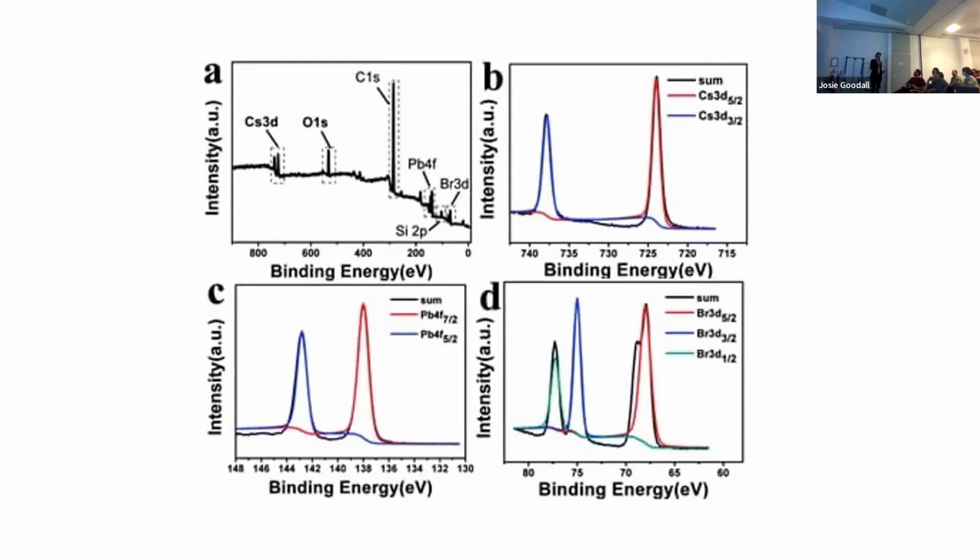Okay, there's a really obvious one. Backgrounds are wrong. Yeah, the backgrounds are awful. So backgrounds here. Yeah, this is bad. I don't even know how it's possible.